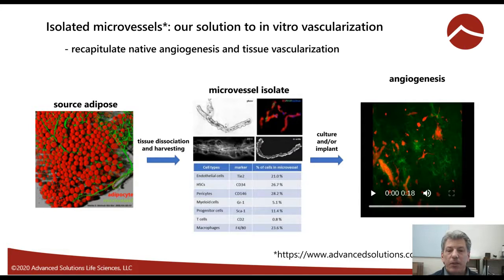Importantly, if you take those microvessel segments and embed them in a three-dimensional tissue environment, here green collagen fibrils, then the red microvessels are growing. You'll see these new vessel segments grow out via angiogenesis. They'll change direction and they'll actually find each other and connect and start to form this neovascular network. It's a dynamic system. It's a messy system. In the video playing here, perhaps you see a variety of different cell types that are moving around. Again, we think all of those are important to help start reconstituting as much of that tissue stroma as possible.